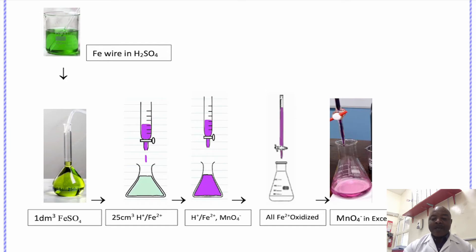After a period of time, the color changes from purple to colorless, and then a permanent pale purple color is observed. That is the end point of the titration.